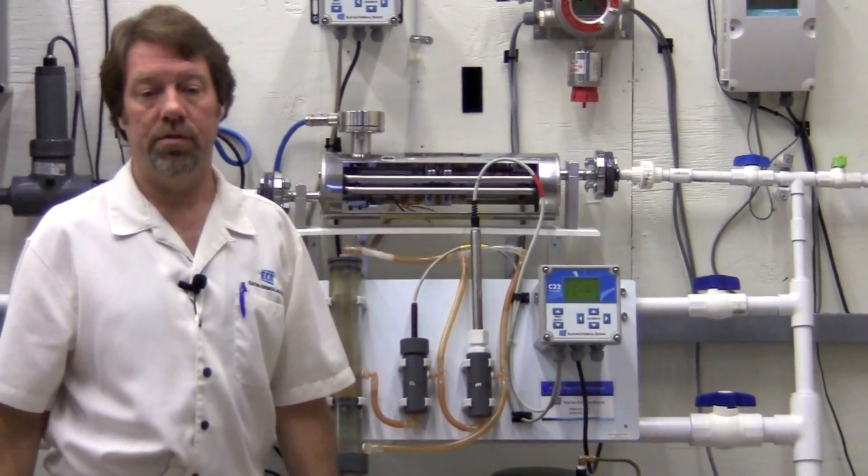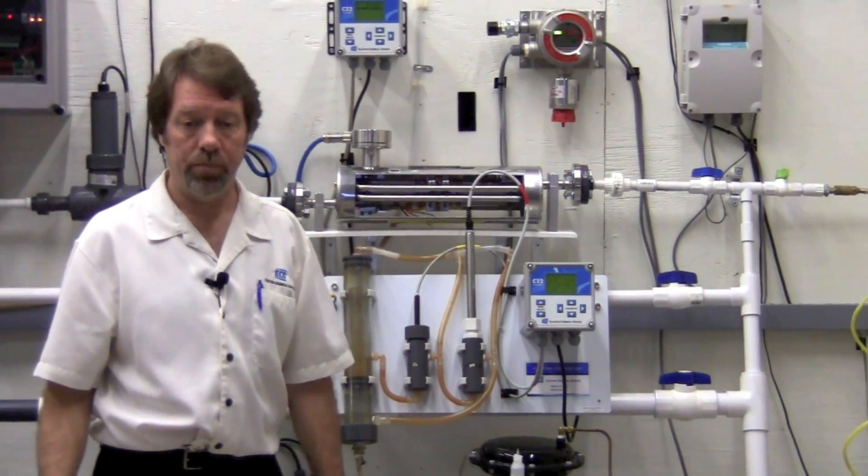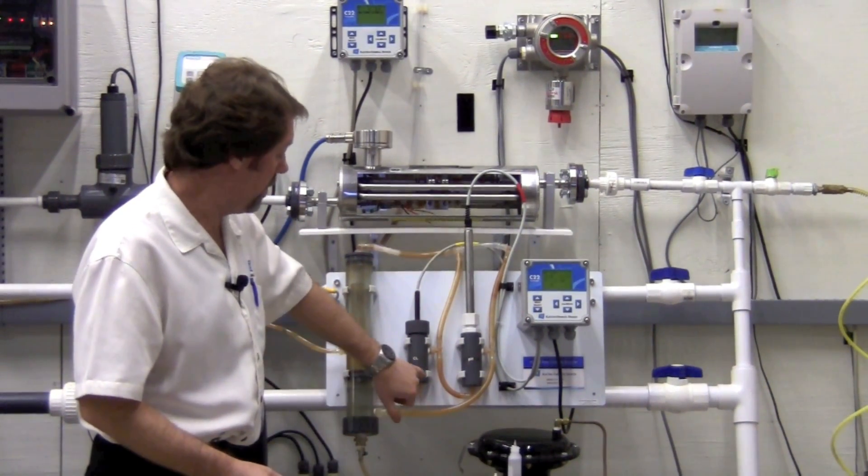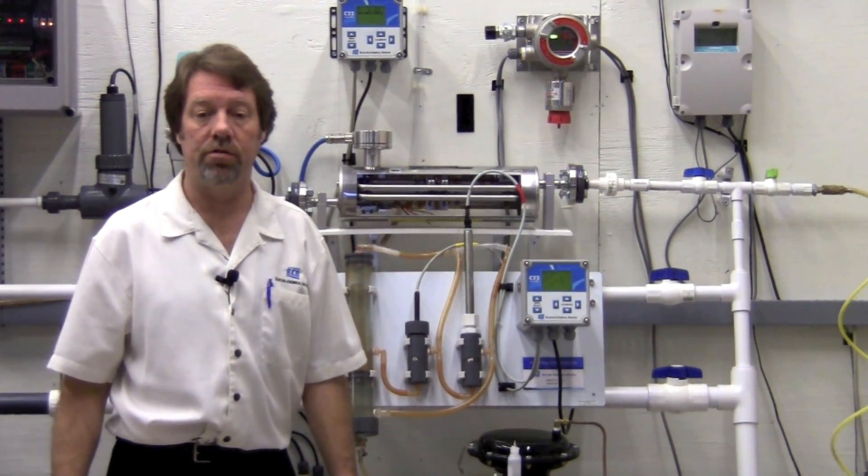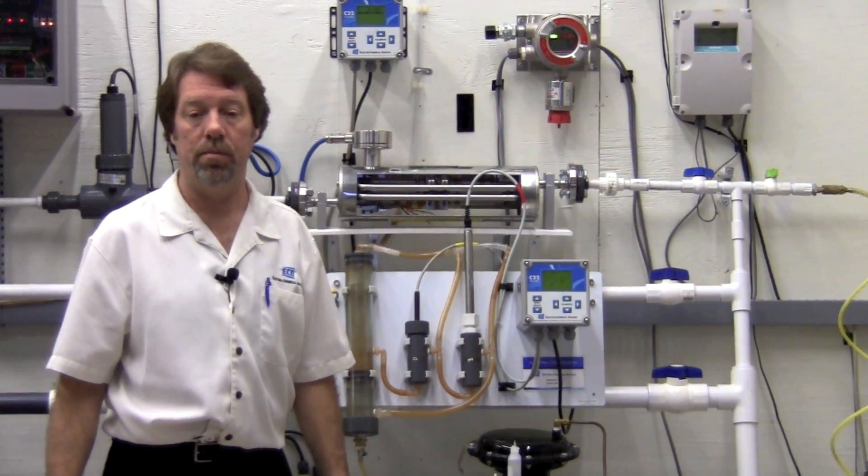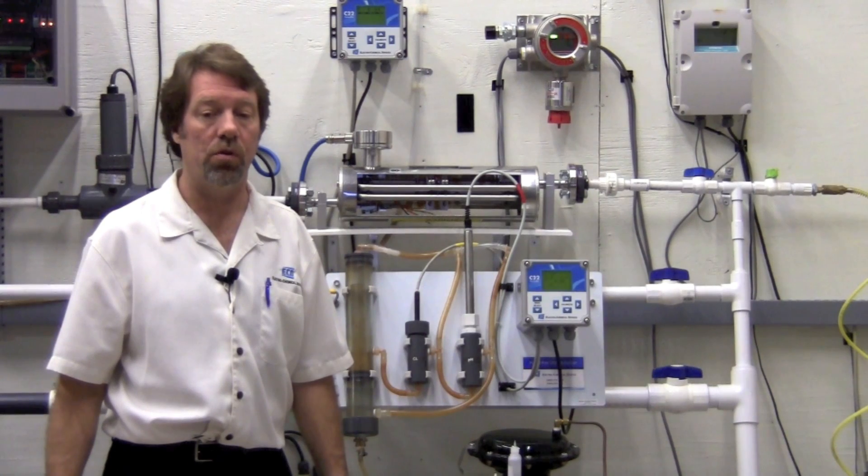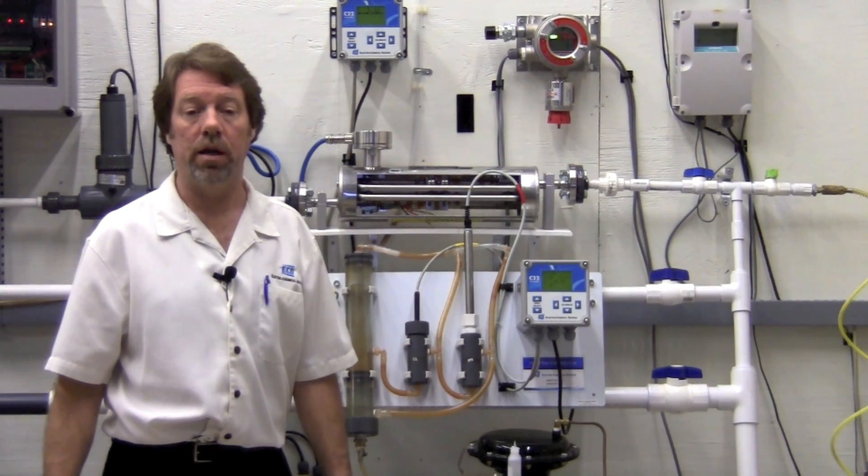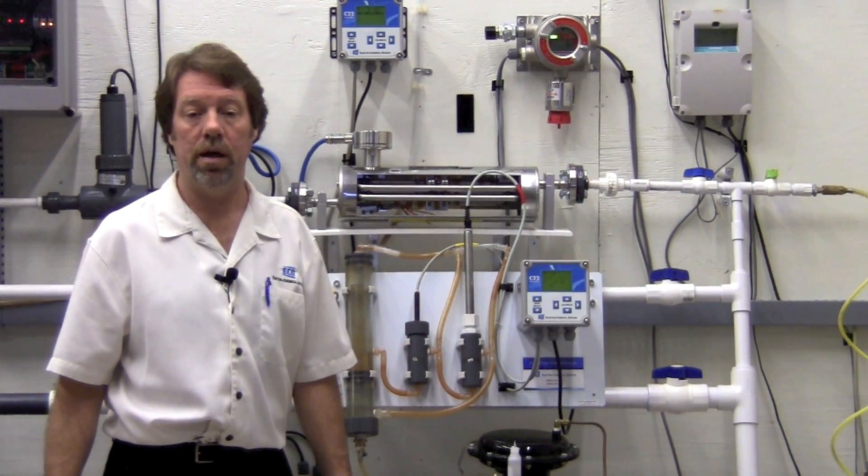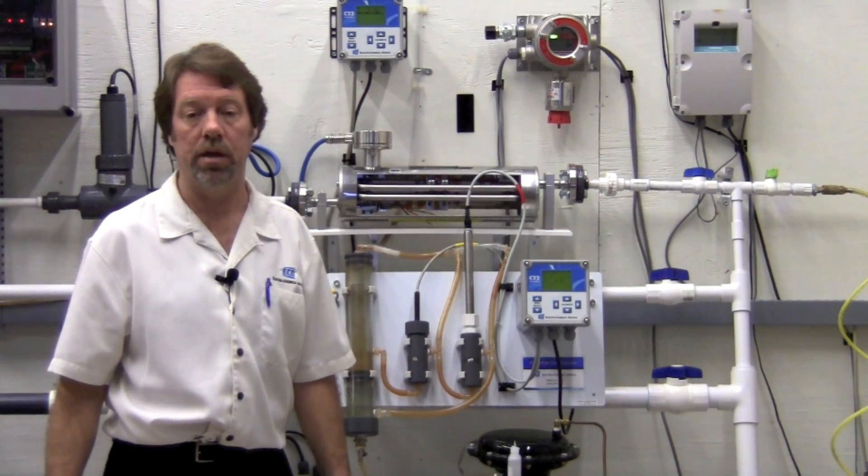Some of the system options is a spray jet cleaner nozzle which would be installed on the chlorine or the pH sensor flow cell if there is a buildup that's causing premature drift in the reading. ECD can supply the control solenoid for the spray cleaner along with the control relays and software logic for a complete cleaning system.